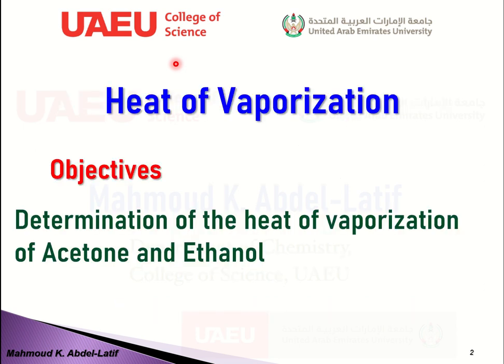Today's experiment, inshallah, will be the heat of vaporization. Our objective for today is just the determination of the heat of vaporization of different solvents, especially acetone and ethanol. Let's see how we can determine this heat of vaporization.